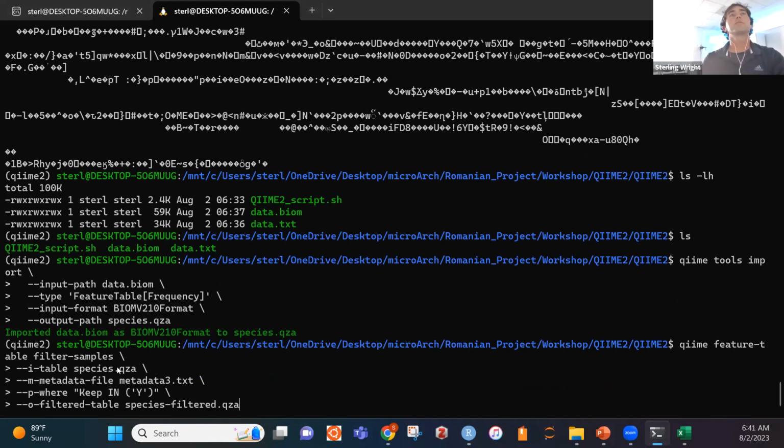I'm going to call on the species.qza file, then use my metadata file. I'm going to tell it to keep everywhere in the metadata where there's a Y. I have a column in my metadata file called keep, and only in my biological samples I put Y; my control samples I put N.